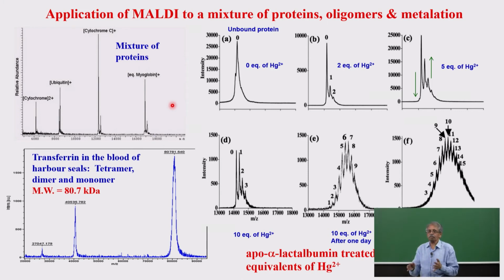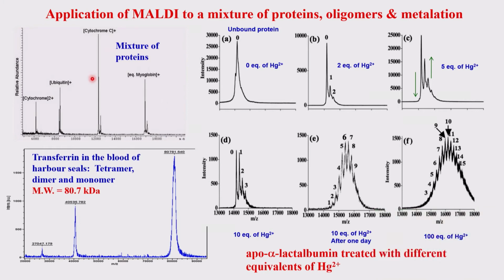You can very happily identify the proteins in a mixture of proteins, and this is a very good technique, and that is why it is used in proteomics. So, the proteomic area is developing a huge amount of materials in protein engineering, protein technology, in the vaccine area. So, all of these are where you use proteomics.